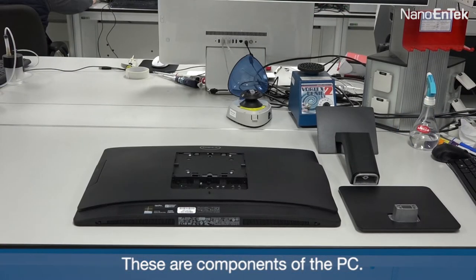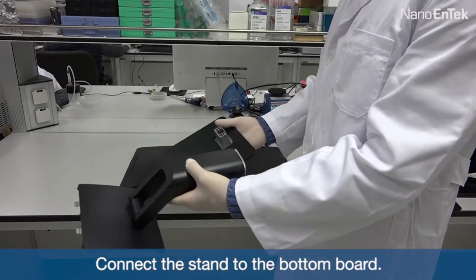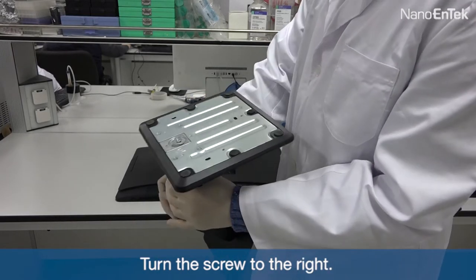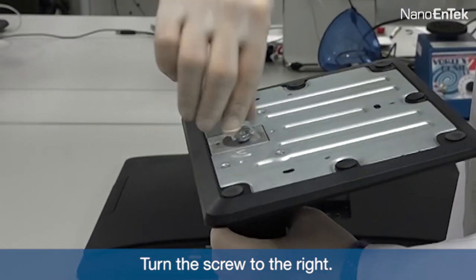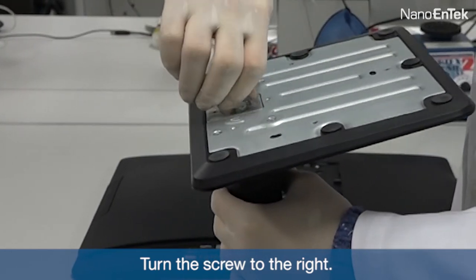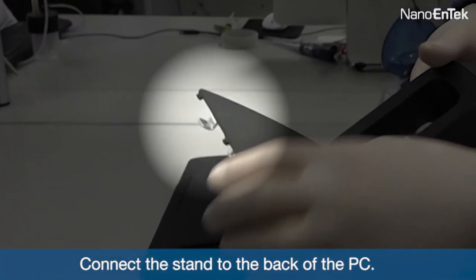These are the components of the PC. Connect the stand to the bottom board and turn the screw to the right. Then connect the stand to the back of the PC.